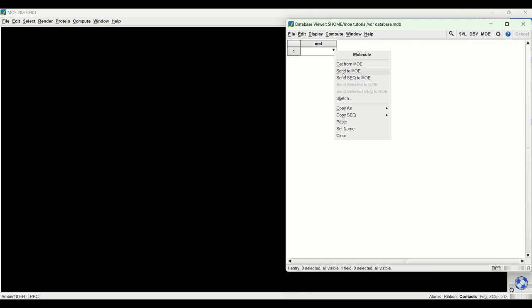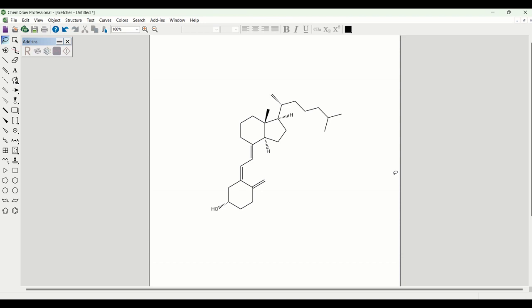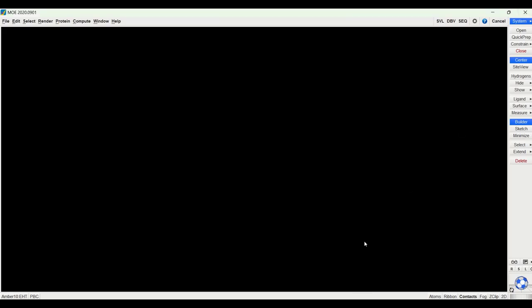To do that I would click this dropdown here and click Sketch, and it will automatically open ChemDraw. If you have ChemDraw downloaded on your computer you can then just draw whatever molecule you'd like. So here I have drawn the structure of vitamin D3. When you draw structures here it is important to take into account stereochemistry because MOE will retain the stereochemistry. If you have a chiral center in your molecule and you put it as racemic, MOE will just pick one isomer over the other, so it is important to take into account stereochemistry.